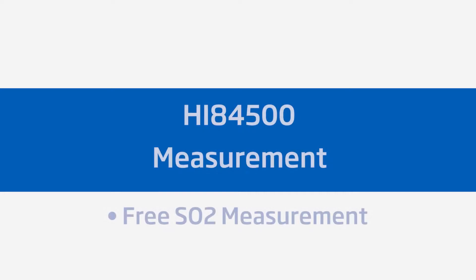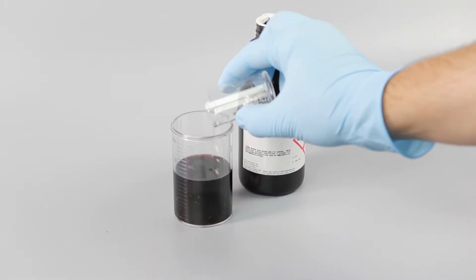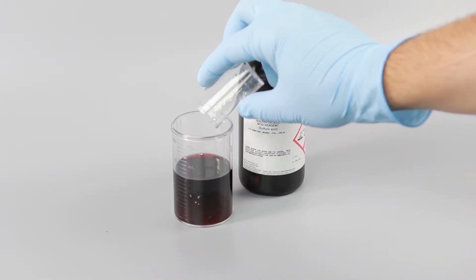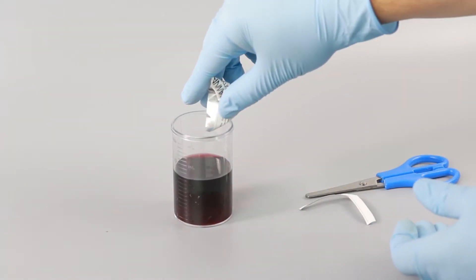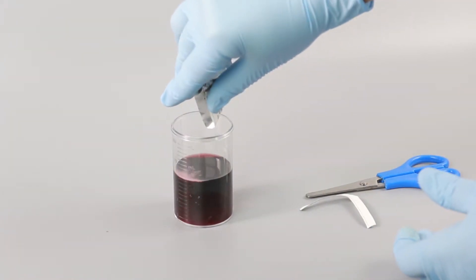Taking measurements with the Hanna HI84500 mini titrator is simple. To measure free SO2 content, take a 50 ml sample of your wine and prepare it the same way as the calibration standard. Add 5 ml of your HI84500-60 acid reagent and one packet of HI84500-62 stabilizer.